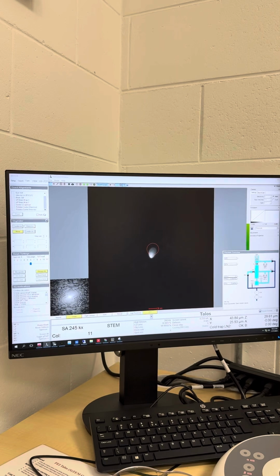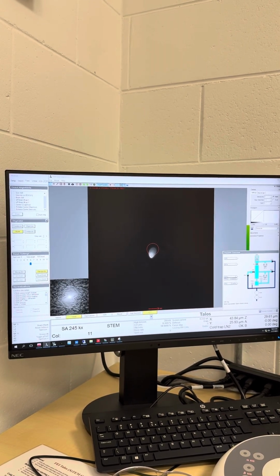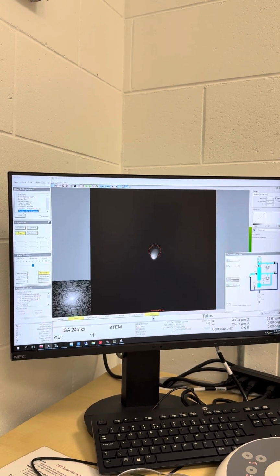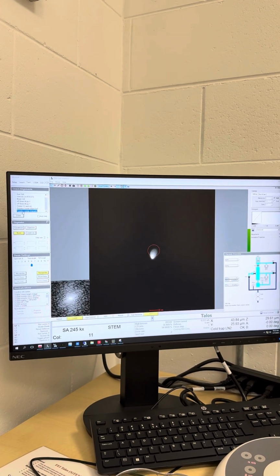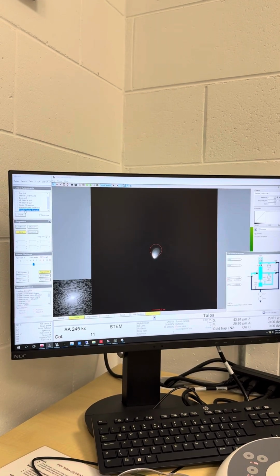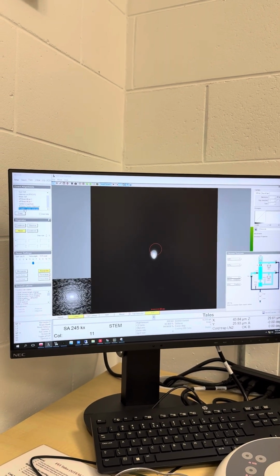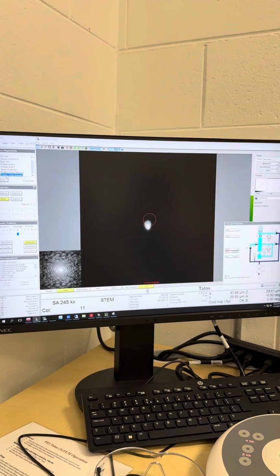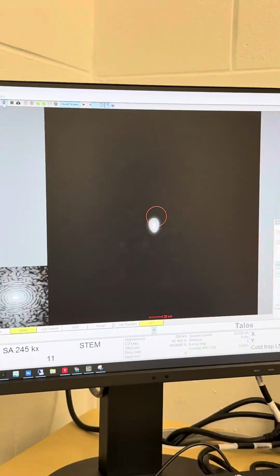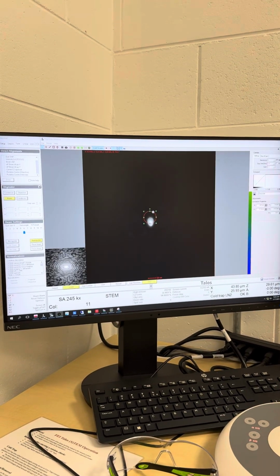So for this one, you want to make sure you've expanded the beam enough for you to see the caustic spot, but I already did that at the start. So go to rotation center, completely stop the wobbling, and then use the X and Y knobs to bring that bright spot into the middle of the disc, which is that. That's sort of what you want.